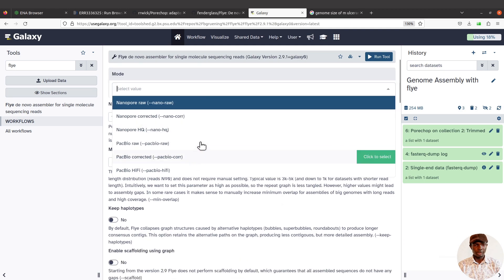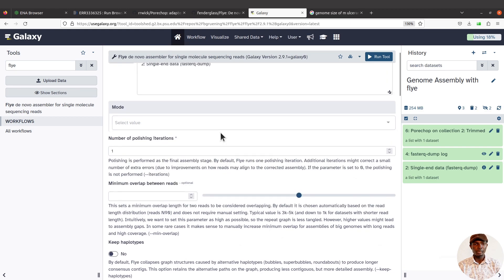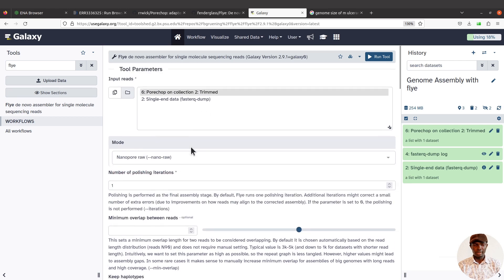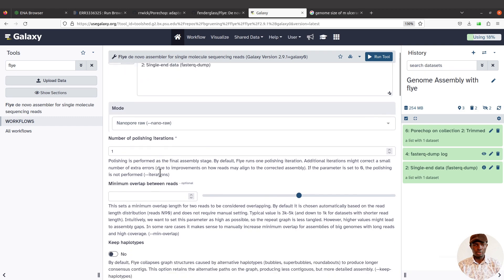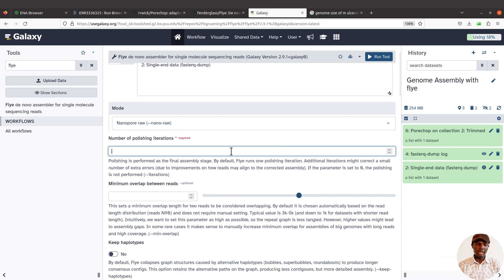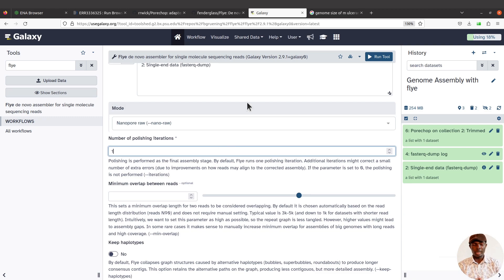Scroll down to select the other options. For the mode, select 'Nanopore' since our data is Nanopore — if you have another sequencing technology, select the appropriate option. For the number of polishing iterations, the default is 1, but you can increase it. You can start with 1, assess the assembly quality, then increase polishing iterations and compare results. For this tutorial I'll leave it at 1.